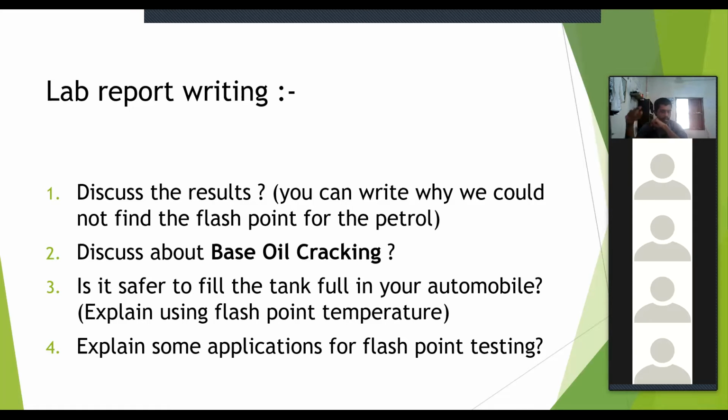Then there will be a reduction in that viscosity. When the viscosity is reduced, that oil will evaporate more, right? That is your point of view, I think. That is okay, but I think there will be a lot of contamination inside. There will be wearing parts also, no? Dust and dirt, those things. That mass will cause the evaporation to be detected differently, because those things will absorb the temperature. Then that will cause the flash point to increase. If you want to flash up that oil, then we have to increase the temperature, right? Sometimes it can happen, but in most cases I think the flash point is increased.